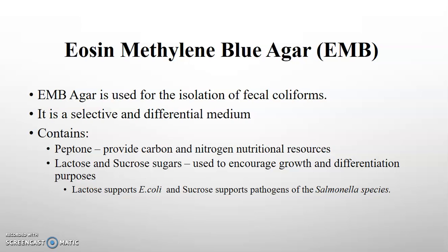And typically, E. coli found in feces is a normal thing. It's the most common bacteria found in feces, and it doesn't always mean that it's pathogenic. It's just kind of the normal biota that's found in feces, and it does commonly use the lactose. However, Salmonella bacteria are often pathogenic, meaning they can cause disease, and Salmonella typically are going to use the sucrose as a source of fermentation, as an energy source.